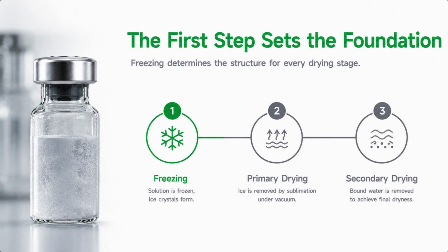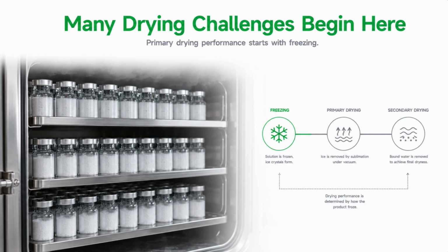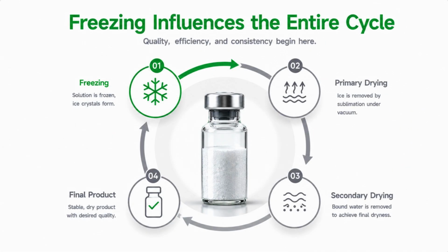Although freezing occupies only the first stage of the lyophilization cycle, it establishes the product structure upon which all subsequent drying depends. Many challenges encountered during primary drying can often be traced back to decisions made during freezing.